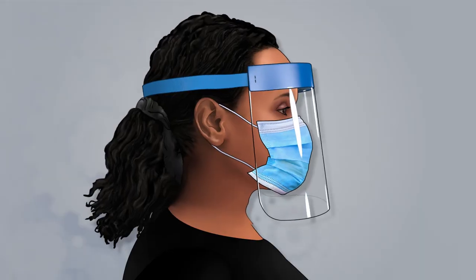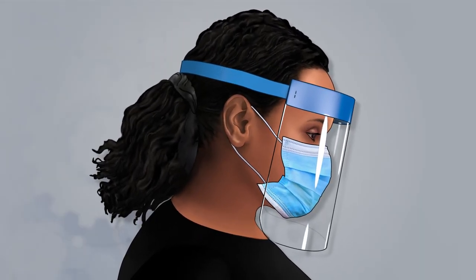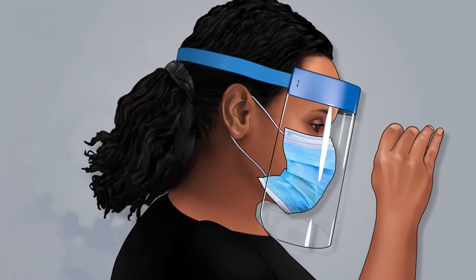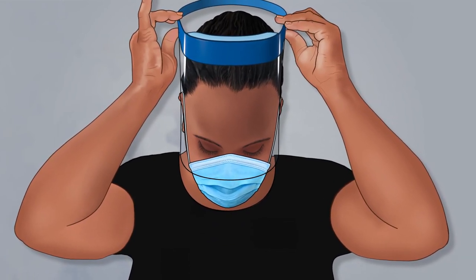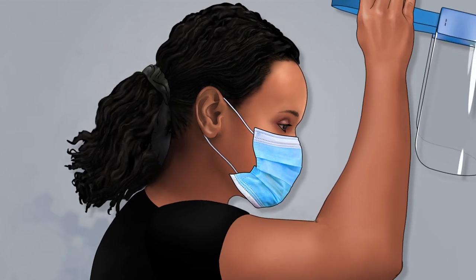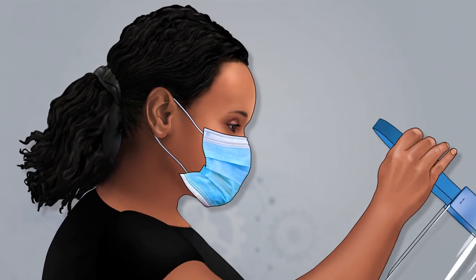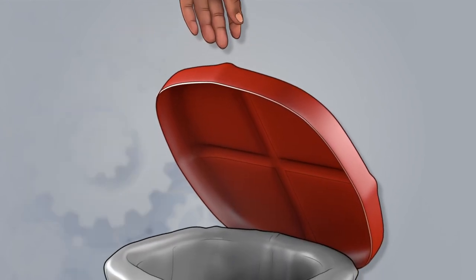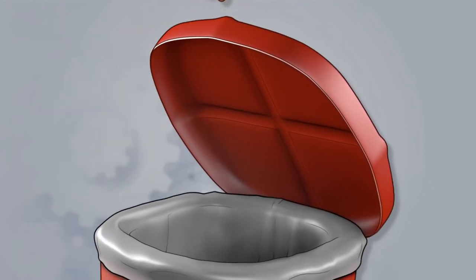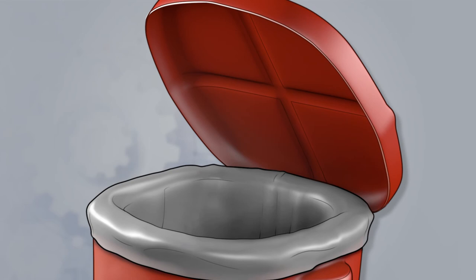Tilt your head slightly forward to take off your face shield. Grasp the straps above the ears and gently lift the face shield away from your face, taking care to avoid contaminating the shield itself, which may be potentially contaminated. Then discard the disposable face shield in the biohazard waste container.